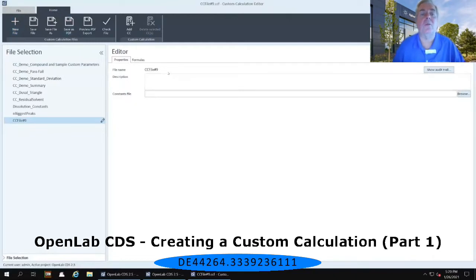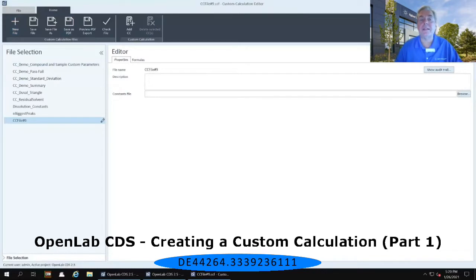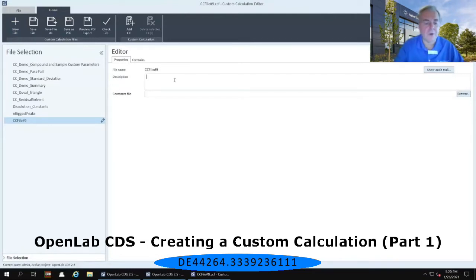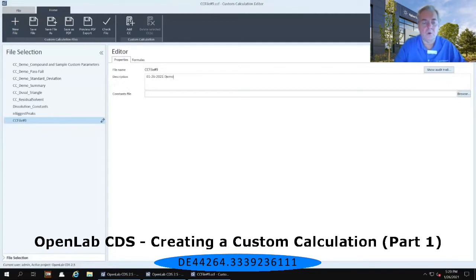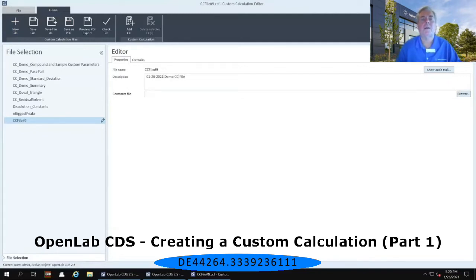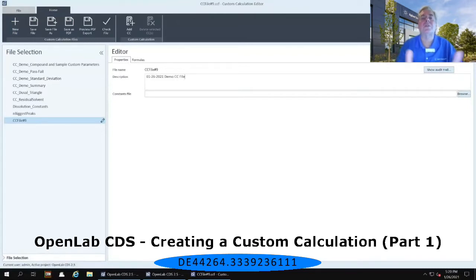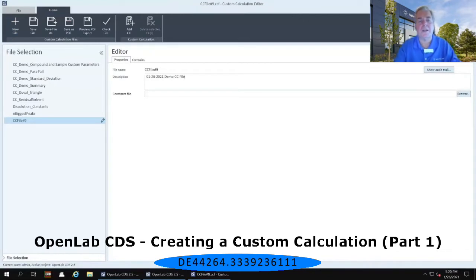On the right hand panel, we are presented with the editor first and then properties immediately below that. So, first of all, we can put in a description for this custom calculation file. You can put in whatever description you'd like. Now I'm going to explain what a constant file is down below, but we're not actually going to use it because it's used by a fairly small subset of most of my customers that are out in the market.